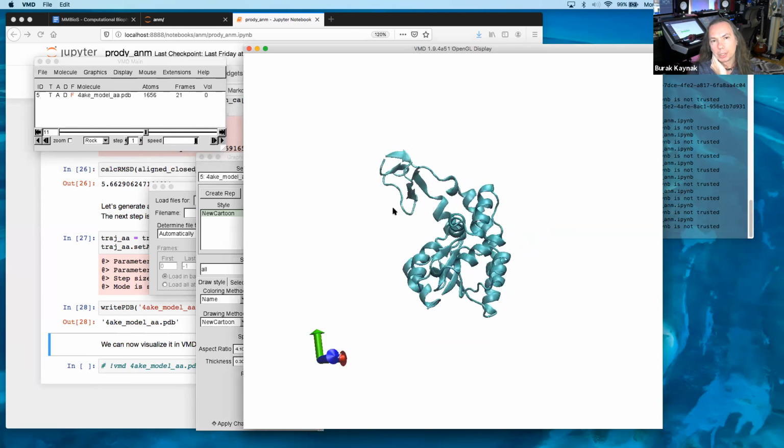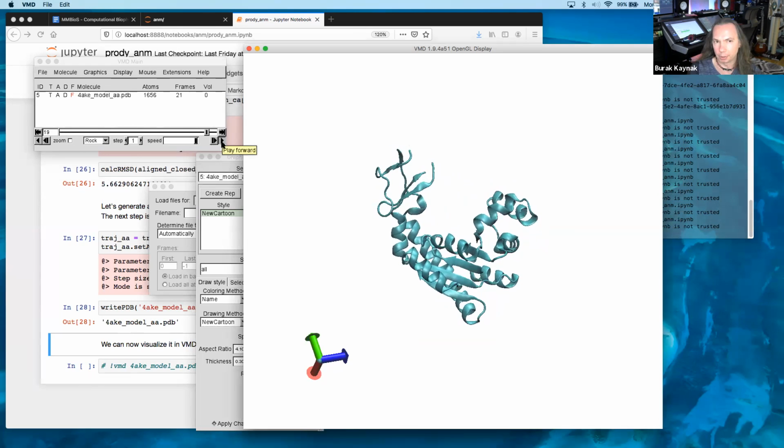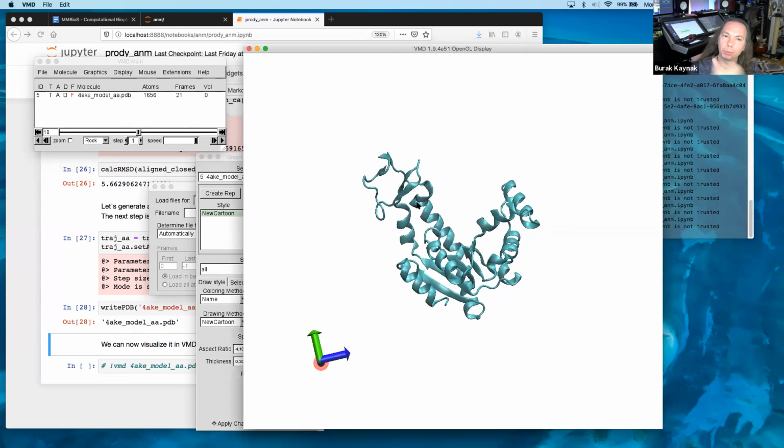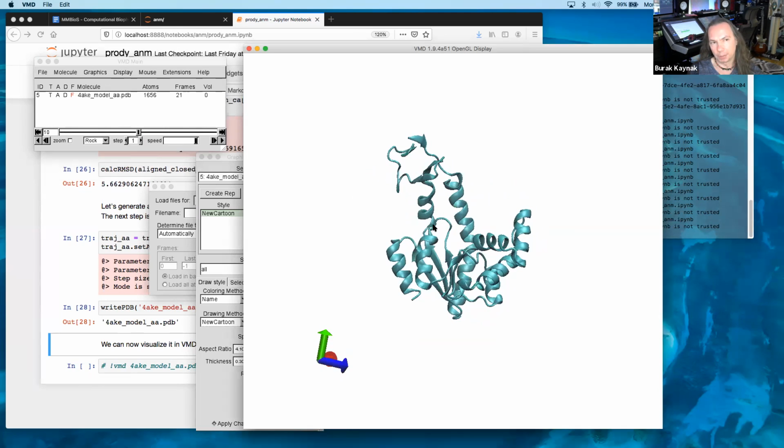Of course, some of you may realize that there are some places that look broken, since we deformed the structure but didn't relax it, okay? In order to make those parts connected, you have to do a minimization on the structure. Then it becomes connected and relaxed, and you can still use it.